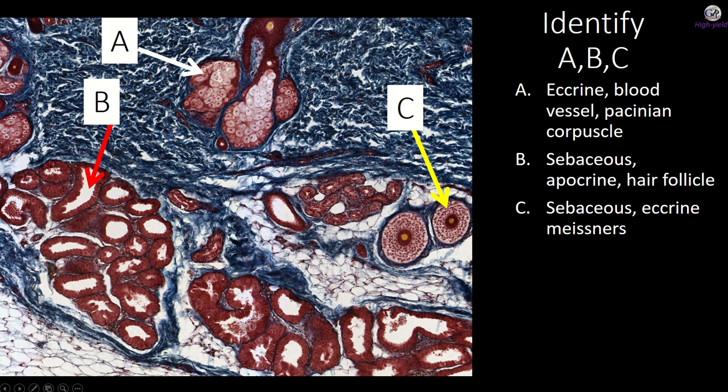All right, A, B, and C. A: these are big cells, puffy, all close together next to a hair follicle. So I'm going to go with sebaceous gland for A. Here's a hair cut, so that yellow orangish cornified cut of hair always gives that away for me. Here's more hairs. And so for C, I'm going to go with these are hair follicles.